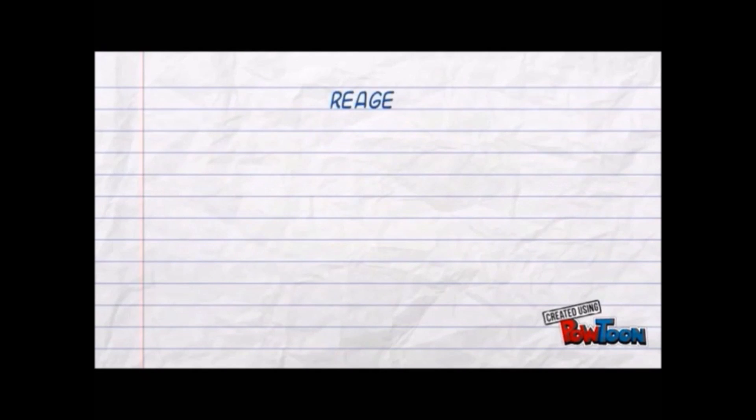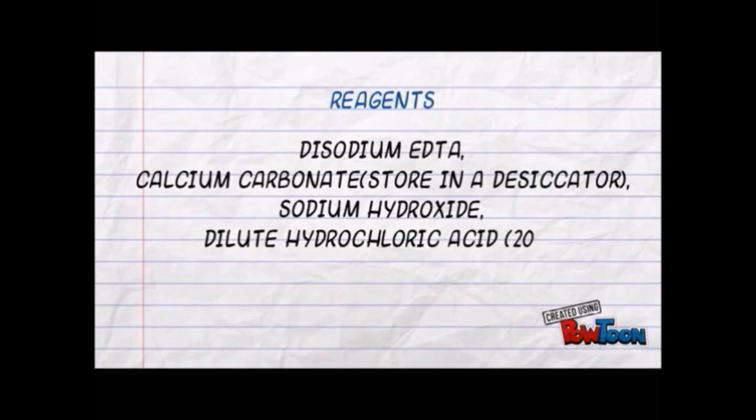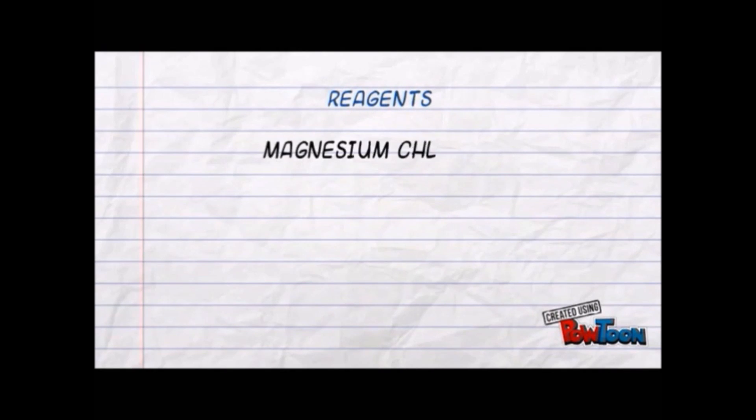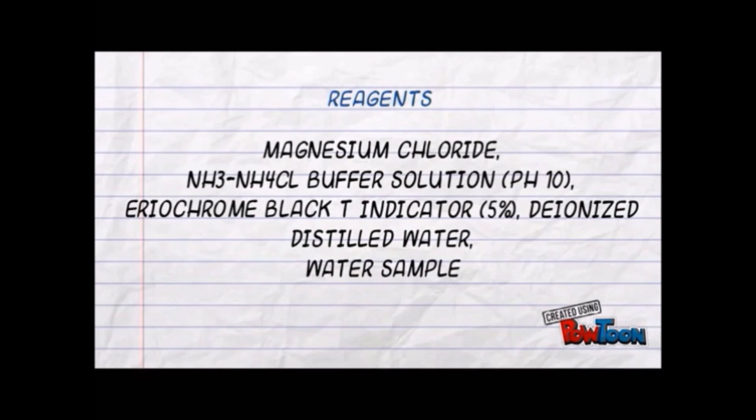Reagents include disodium EDTA, calcium carbonate stored in a desiccator, sodium hydroxide, 20% dilute hydrochloric acid, magnesium chloride, ammonia ammonium chloride buffer solution at pH 10, 5% Eriochrome Black T indicator, deionized distilled water, and a water sample which can be tap water, mineral water, or ground water.